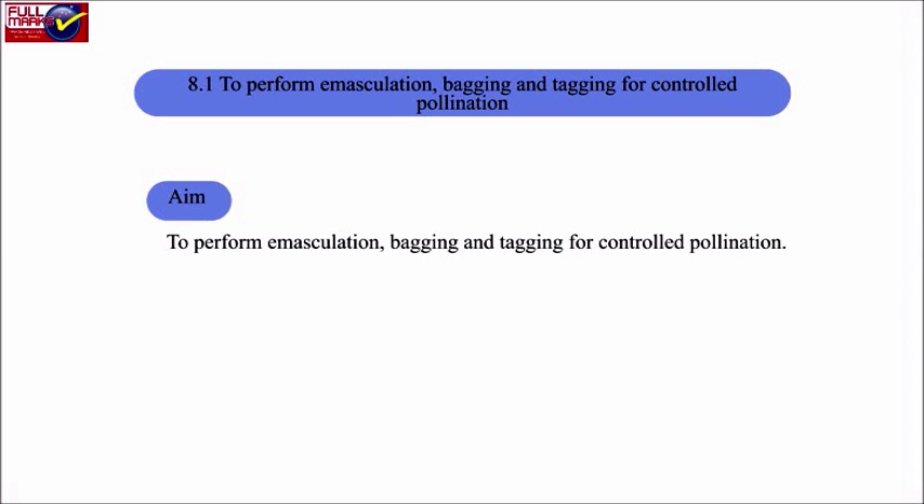Aim: To perform emasculation, bagging, and tagging for controlled pollination. Materials required: ornamental plants or wild plants bearing large bisexual flowers, magnifying glass, tweezers, small sharp scissors, brush, alcohol, rubber bands, papers, and paper glue tags.